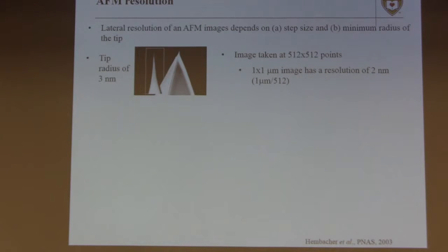What determines resolution in AFM? Several things. And it's not straightforward, but it's kind of simple.